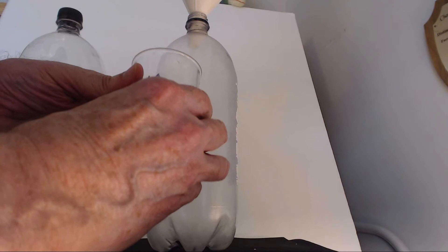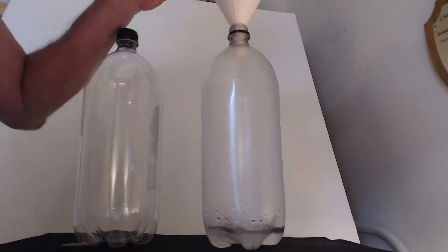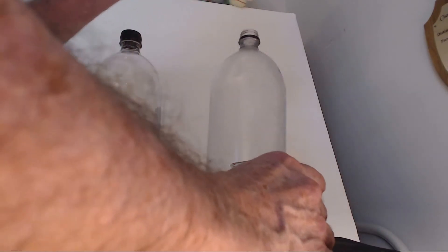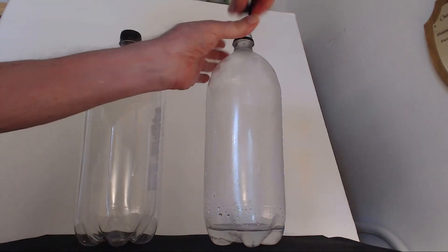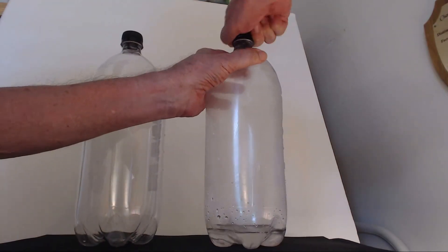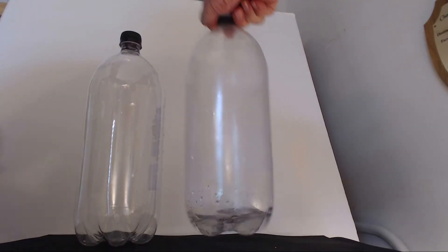10 grams of sodium hydroxide in 100 milliliters of water. Put the cap on nice and tight. Just give it a little swirl.